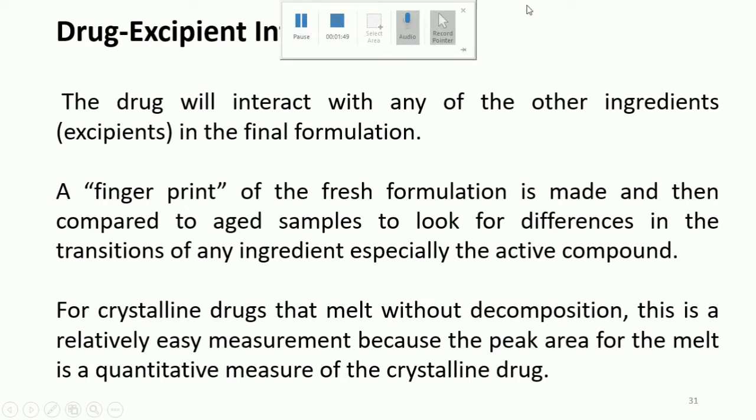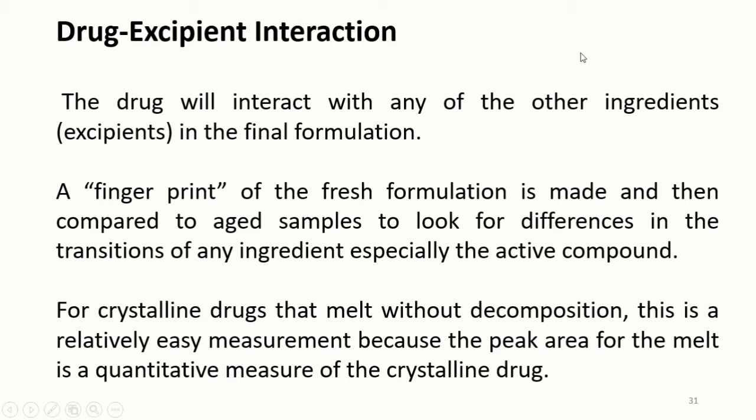there is a possibility of molecular motions. The strong molecular motions may excite some part of the drug or the molecule, and it may help it to interact with other impurities or moisture present in the atmosphere. So that would be quite helpful. The glass transition would be quite helpful to understand the stability and the reactivity of the specific drug.